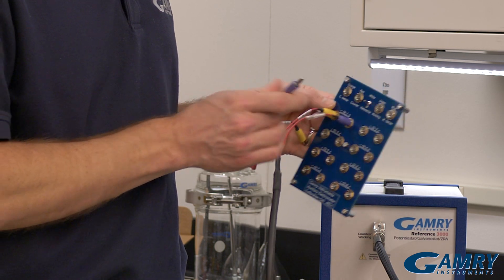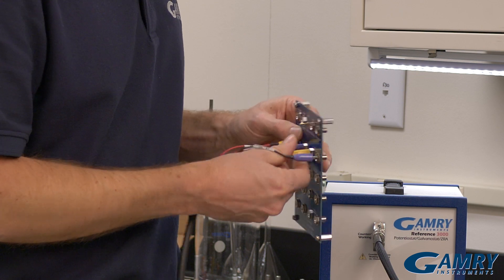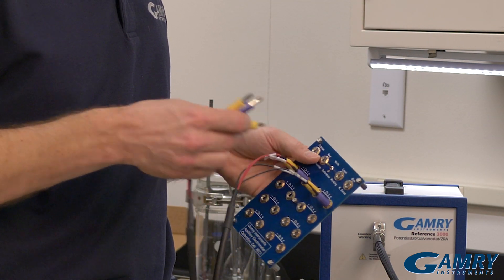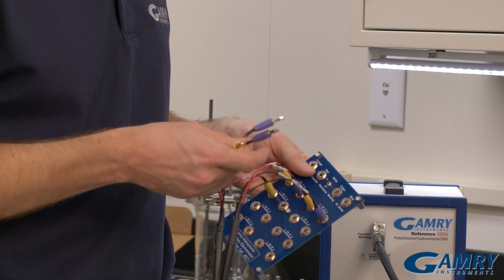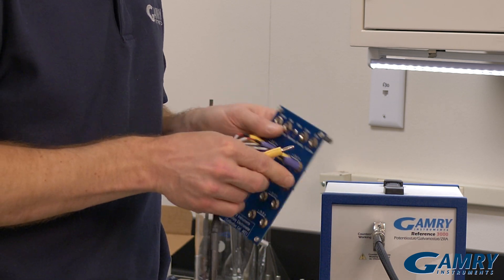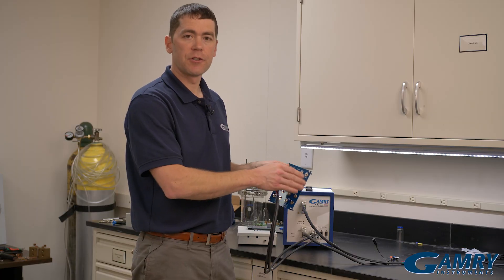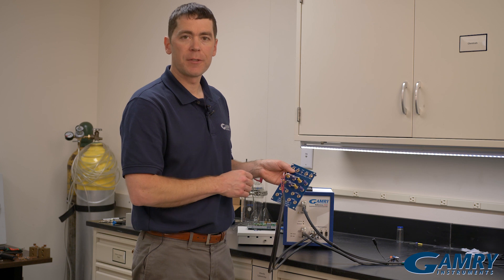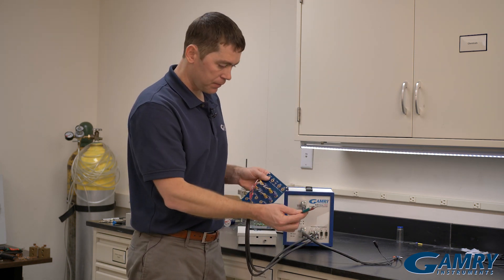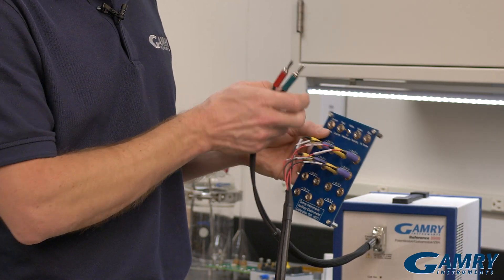So I connect channel one, then I connect channels two, three, and four. I can go all the way up to eight if I want to. Next I'm going to connect the current-carrying leads. These are labeled across the top connectors. They're very easy — they're color coded.